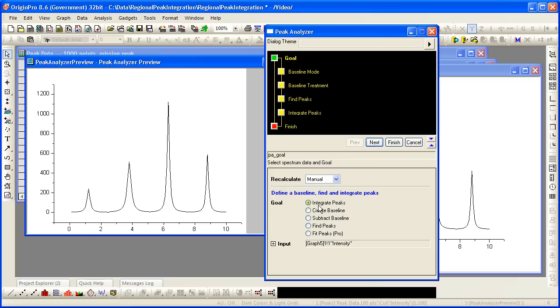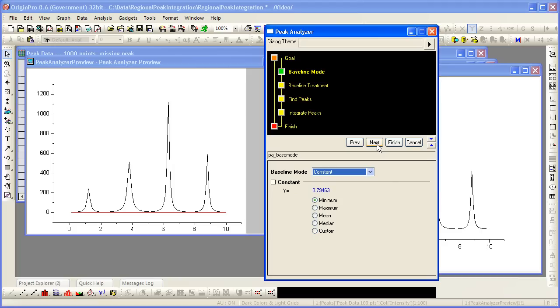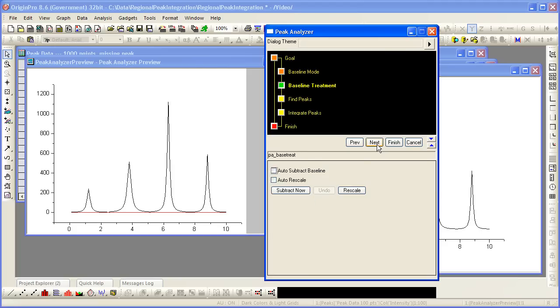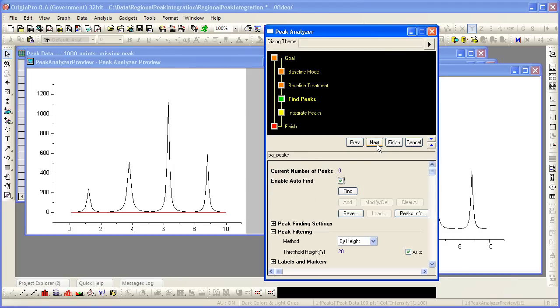I want to integrate these peaks and I will use the default baseline option since this data is very clean and has a constant baseline. I will use origin's autofinder to find my peaks because they are situated in clean data and I don't need to do any advanced peak filtering or finding.